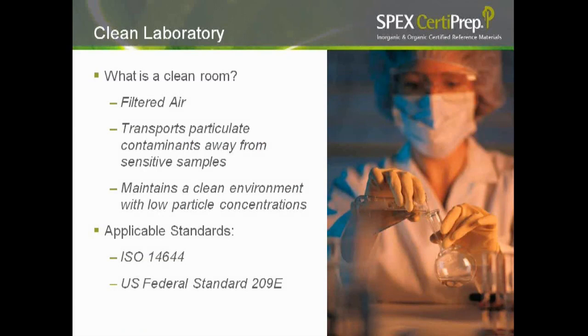So in the previous slide, I mentioned about clean lab. What is a clean room or a clean lab? A room which has a gentle shower of highly filtered air for the purpose of transporting airborne particulate contaminants away from the sensitive samples and maintain a clean environment with low particle concentrations. Environment pollutants that are to be considered are dust, airborne microbes, aerosol particles, and chemical vapors.